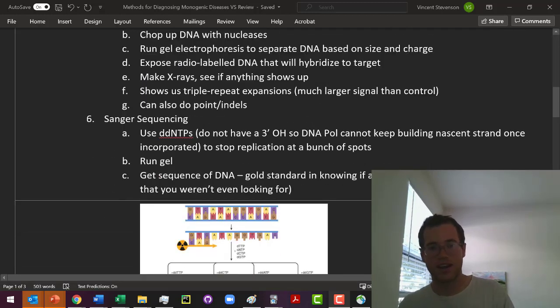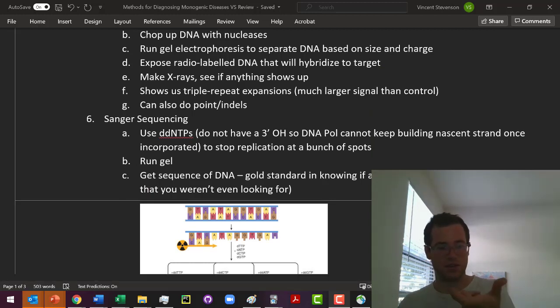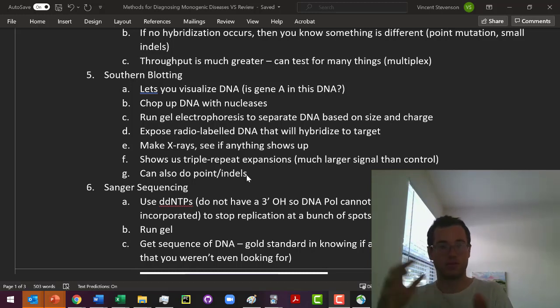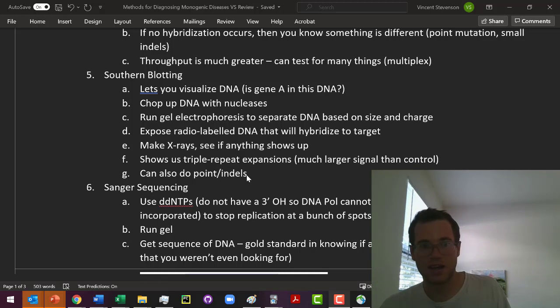against a target. And so if someone had a triplet repeat expansion, so it's like you had a triplet that just kept being multiplied n number of times within DNA, that's a common use case for Southern blotting, because it will help us see it visually. If you do have a region of DNA that just got way more nucleotides in it than we're expecting, so that's the key thing for those types of detections with those mutations.